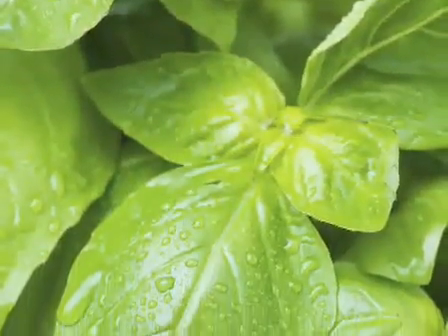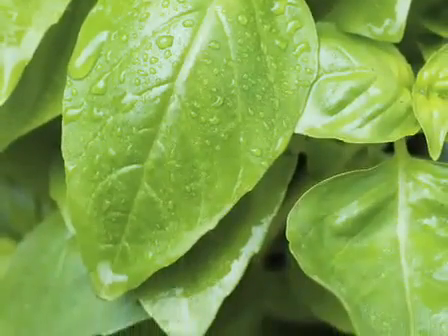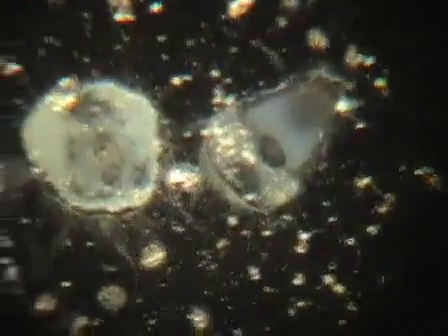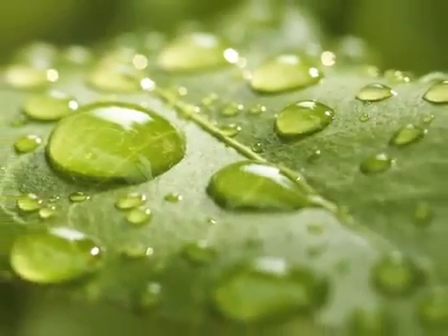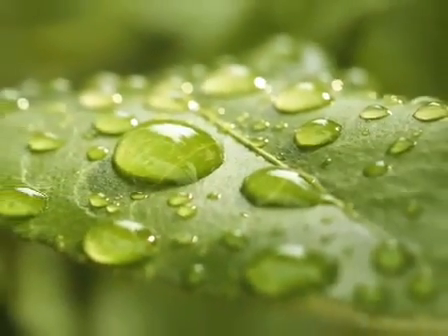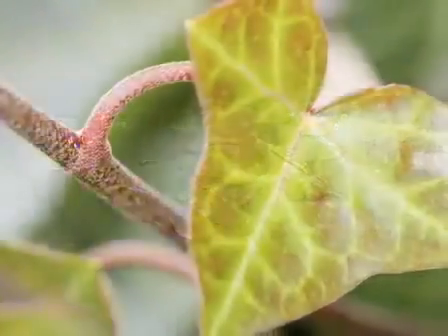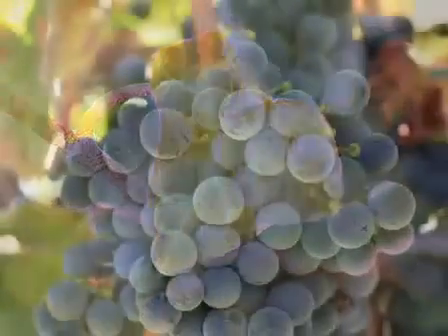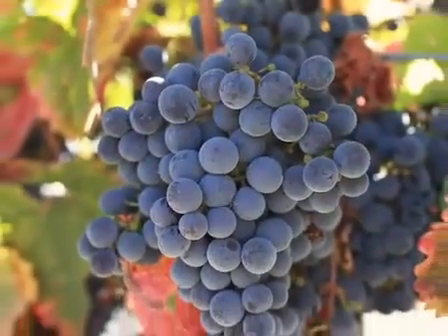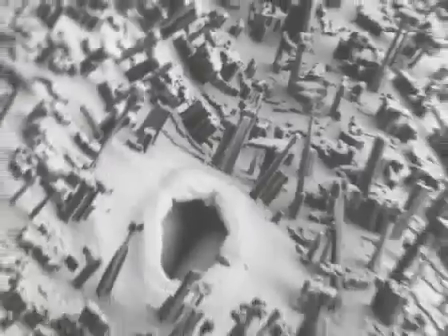The plant cuticle is a waxy outer covering on plants that has a primary role in water conservation, but is also an important barrier against the entry of pathogenic microorganisms. The cuticle is made up of a tough cross-linked polymer called cutin and a protective wax layer that seals the plant's surface. The waxy layer of the cuticle is obvious on many plants, appearing as a shiny film on the ivy leaf or as a dusty outer covering on the surface of a grape or cabbage leaf, thanks to light-scattering crystals present in the wax.